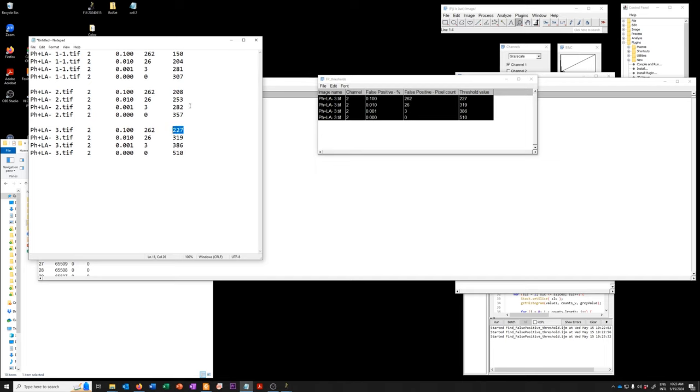So I would average those together and use that as a threshold. If I used a 0.01%, they range from 204 to 250 to 319. So roughly in the 250 range.